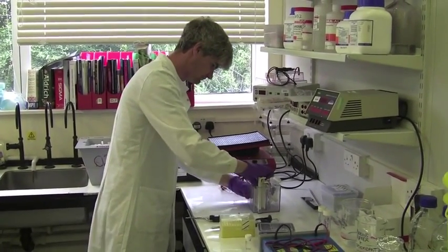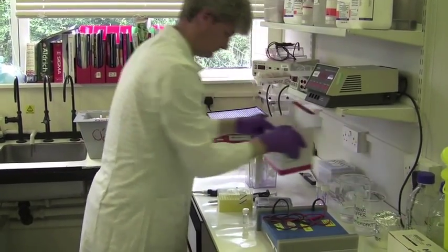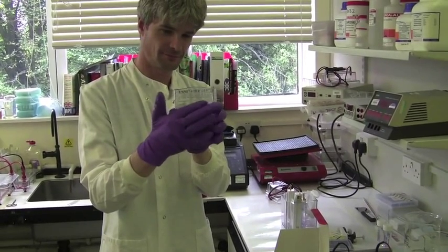In PAGE, migration of proteins is dependent upon the percentage of acrylamide present in the gel. Samples are loaded into wells at the top of the gel.